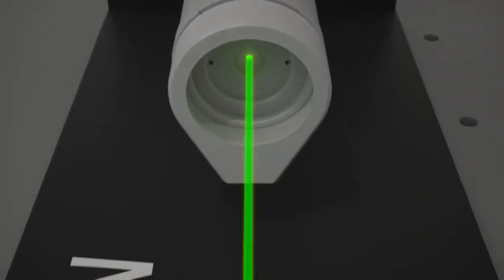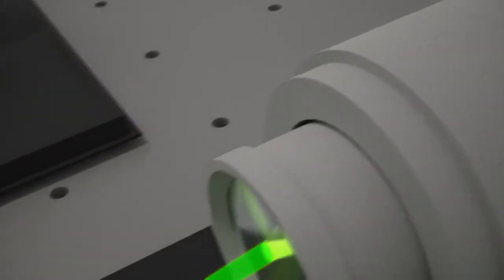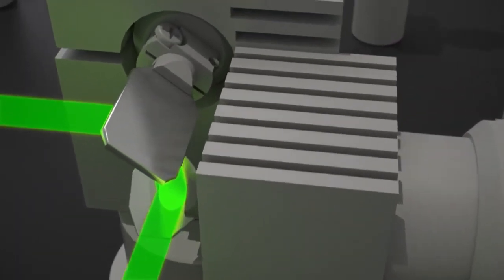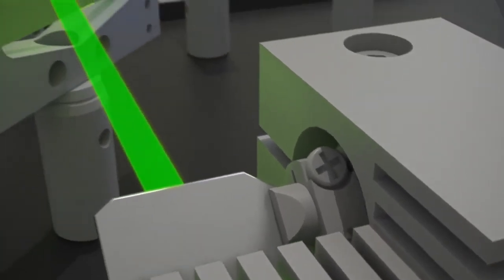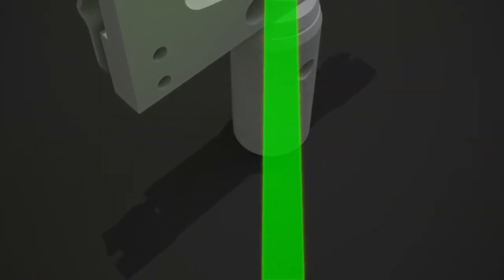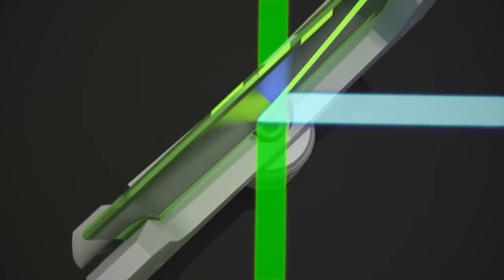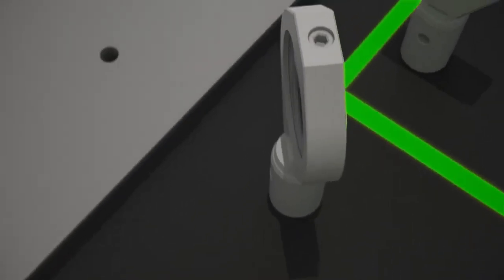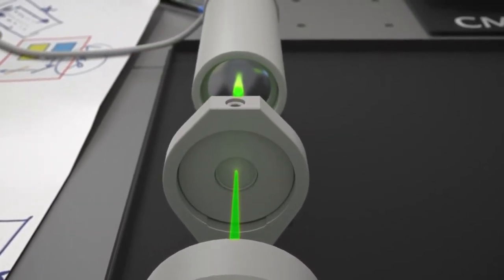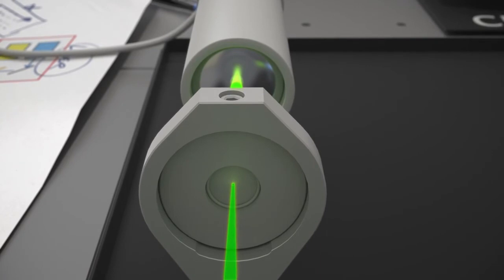The emission light path. The emission light propagates through the microscope towards the output port. It passes the scan lens and hits the X and Y scanning mirrors and travels in the opposite direction of the excitation light towards the dichroic mirror. There, it arrives at the dichroic mirror, allowing only the emission light to pass through. Next, the emission light is focused on the pinhole. The pinhole takes care of sectioning like any other confocal microscope.